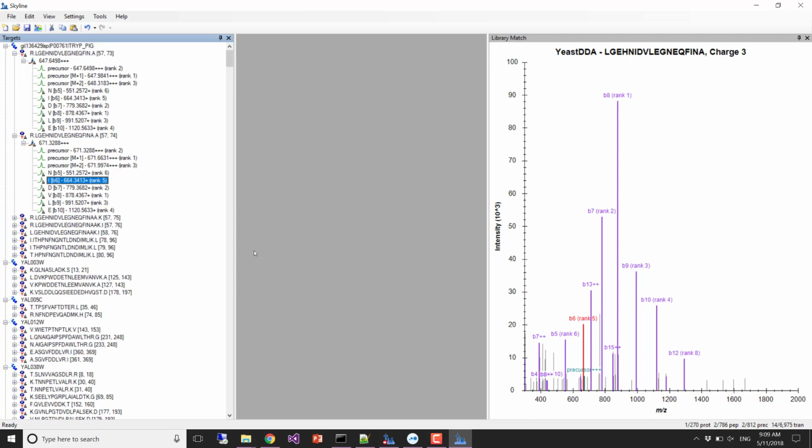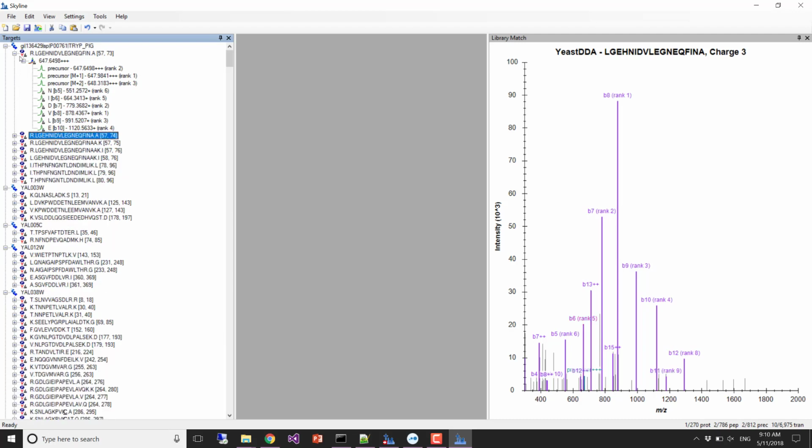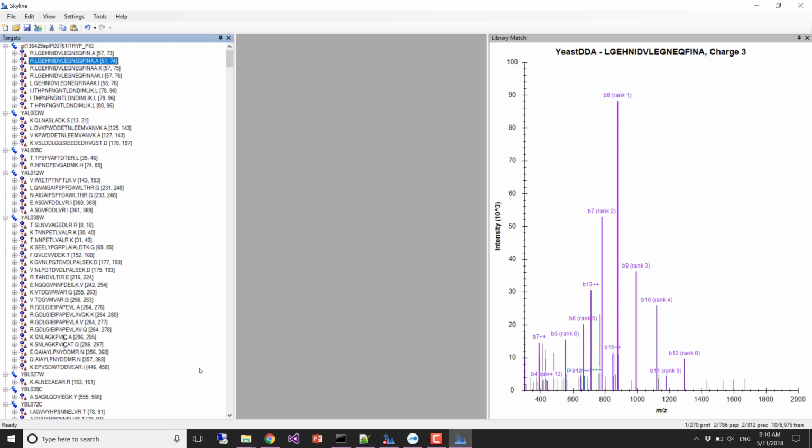And you have retention times, and when we do extraction, it's just going to extract based on those retention times. We haven't set up any iRT library or anything, but we can still even build an mProphet model, and it wouldn't contain an iRT normalized retention time prediction.